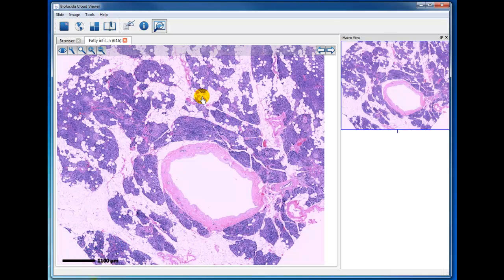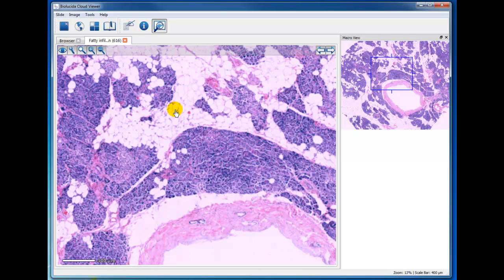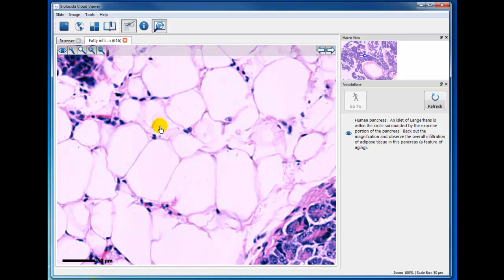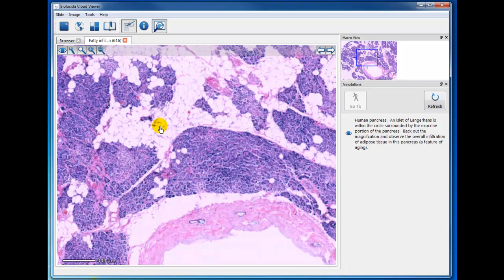So you can see the adipose tissue. By now you're experienced enough that from a very low magnification you should be seeing the little tiny lines between these specimens, and of course a little bit of enlargement is going to show you immediately that this is adipose tissue. And they're the adipocytes that you learned about quite a while ago.